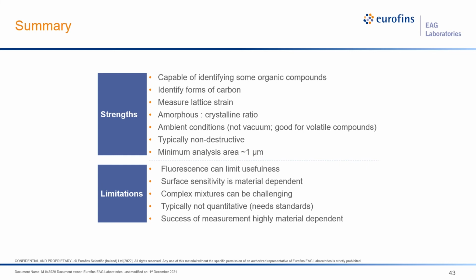So often what you have to do is this photo bleaching to remove this little trace organic molecule that's basically making it impossible to determine the structure of the material. Some materials will just fluoresce too much and we will not be able to get a Raman spectrum. So fluorescence is an issue, and we don't really know a priori if it's going to affect any sample because, again, a very trace amount of this can really destroy any potential for Raman analysis.